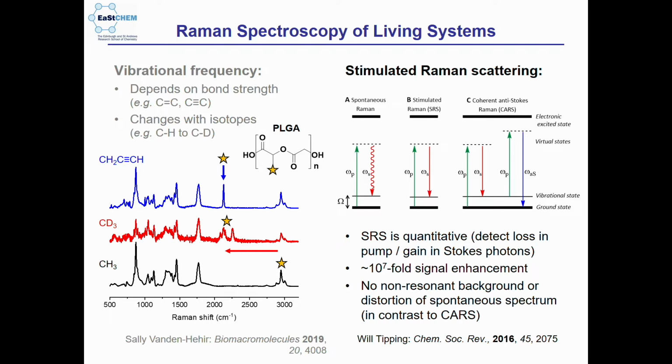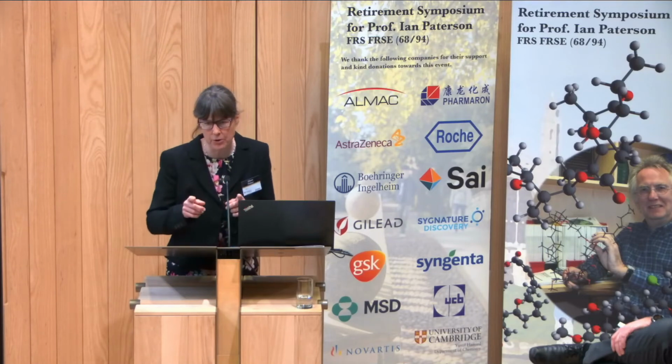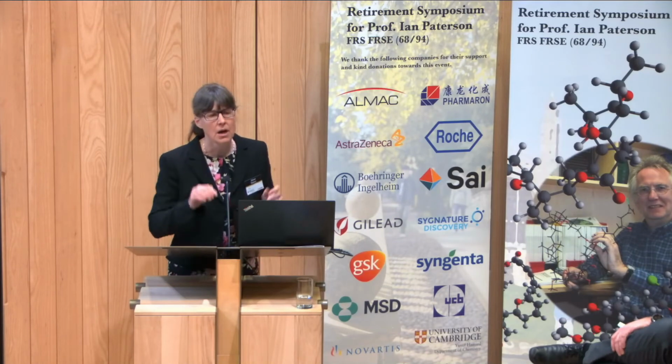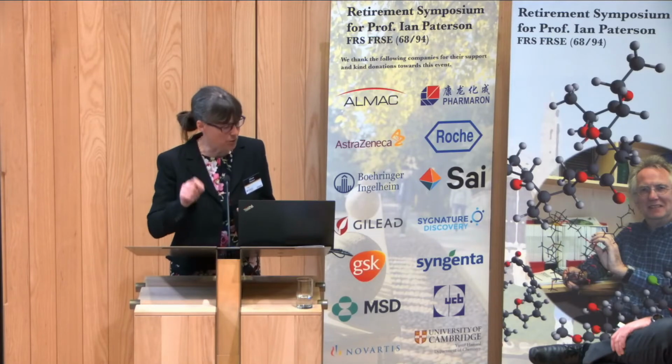pump beam to excite to a virtual excited state, and you're actually measuring the Stokes output, the wiggly red line. What we're going to do is look at using stimulated Raman scattering, and so we're going to have two lasers which we tune, pump beam and Stokes beam, to the vibrational gap, and then we just look for a change in either the Stokes or the pump beam.